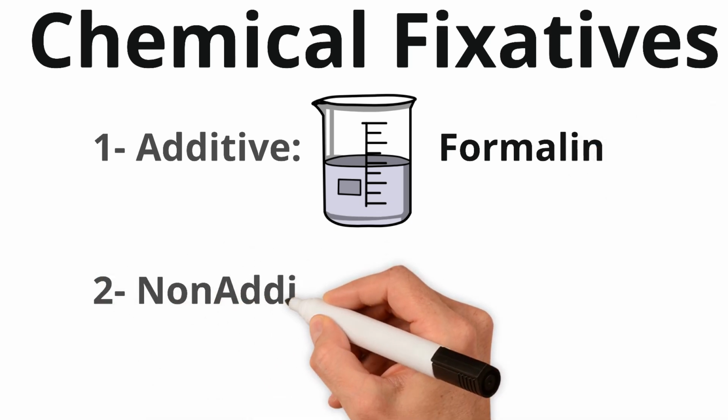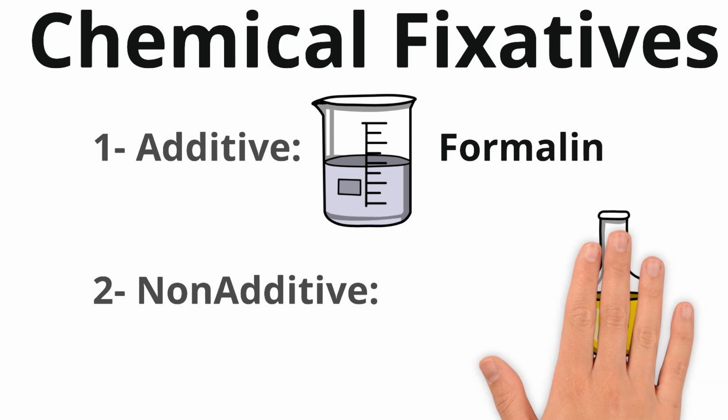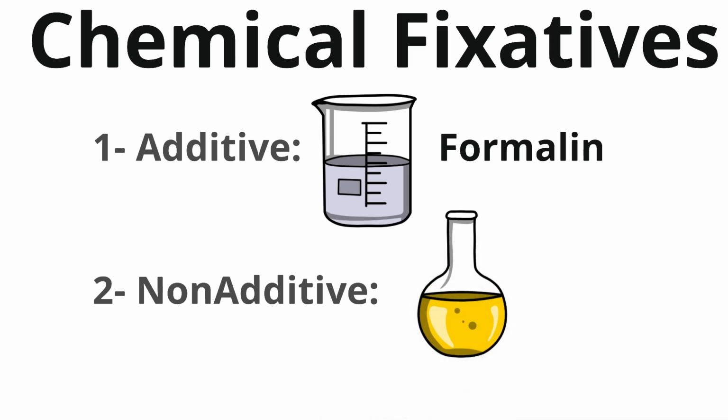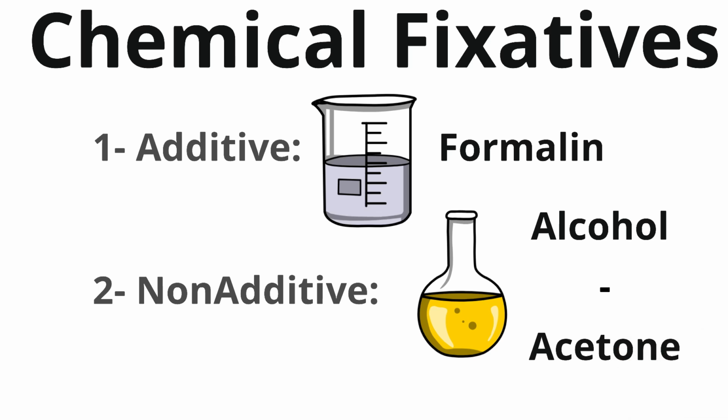Non-additive fixative. The fixative does not bind, but it still alters the protein structure and makes it less water-friendly and more chemically reactive. Examples of this are alcohol or acetone.